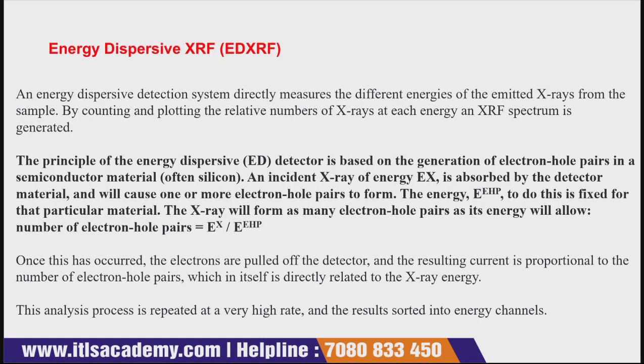Now let us understand this with the help of the principle. In energy dispersive X-ray fluorescence spectroscopy, the incident beam may excite an electron in the inner shell.